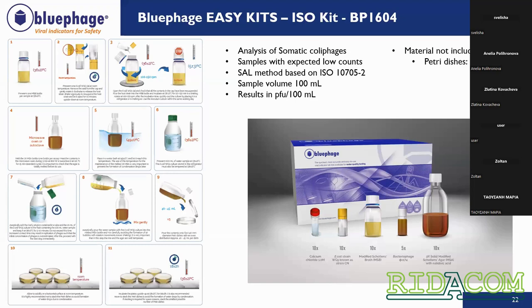So in that case, let me show you how to do the analysis. It's also important to inform you that this kit uses the WG5 E. coli strain, because we are analyzing drinking water, potable water, but sometimes these waters also contain some background flora. Because we want to remove this interference, the MSA in that case also contains nalidixic acid. So let's see how to perform the analysis using this methodology.